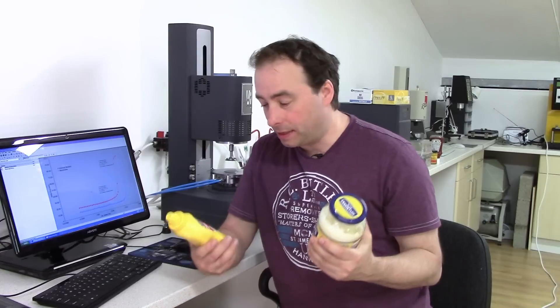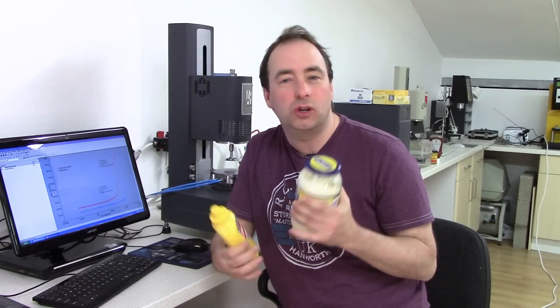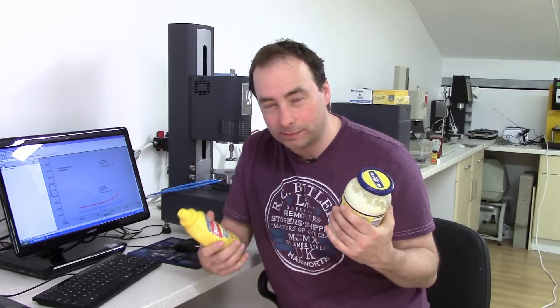In other words, you have to give the mayonnaise three times as hard a push to get it moving than the mustard. And that's going to show itself in how these materials look and feel to the consumer. Yield stress is one of the most underappreciated material properties that we can measure. More than viscosity, it contributes to texture, handling, appearance and a whole host of processing and performance behaviors.